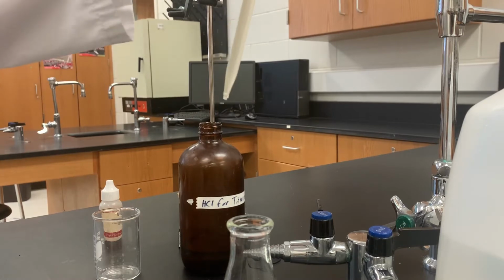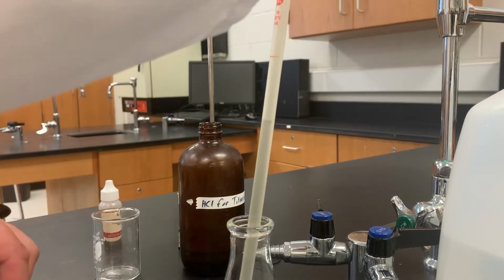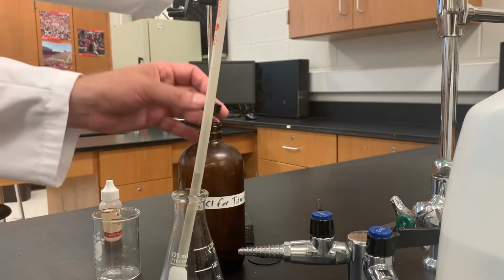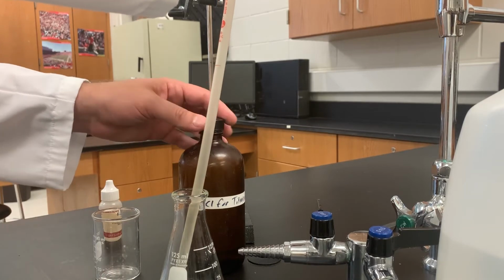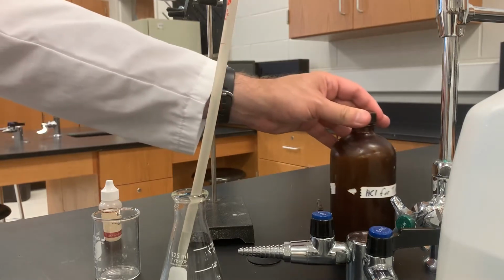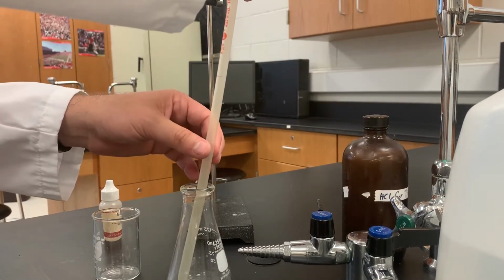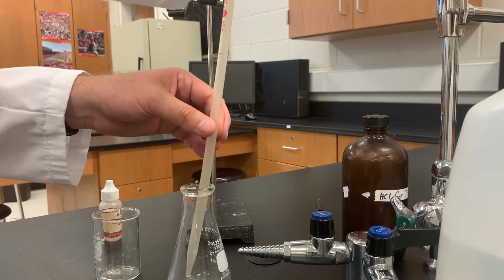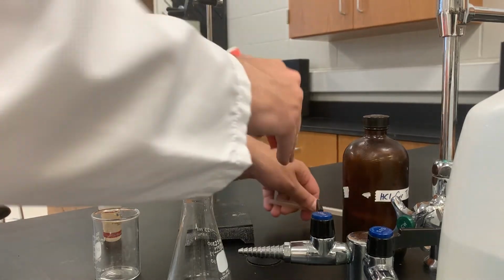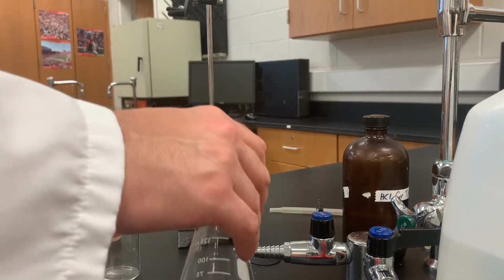And then I'll go over to the Erlenmeyer flask and press the down arrow on the pipette, which will dispense the hydrochloric acid into the flask. And a very small amount of acid may remain in the pipette, and that's perfectly fine. It's calibrated for that to happen. So I've got the hydrochloric acid in here.